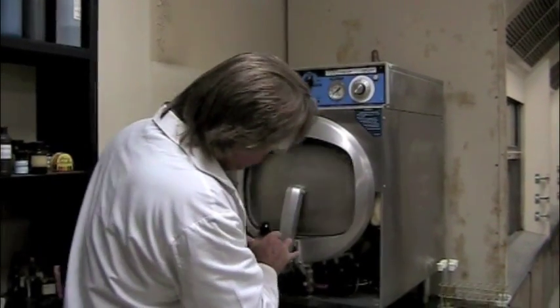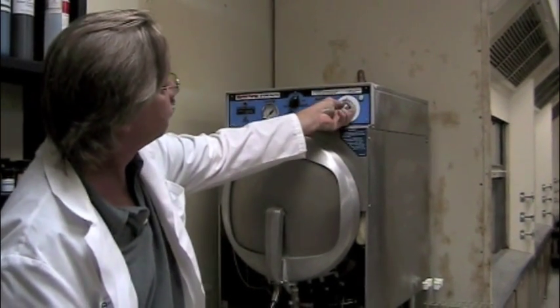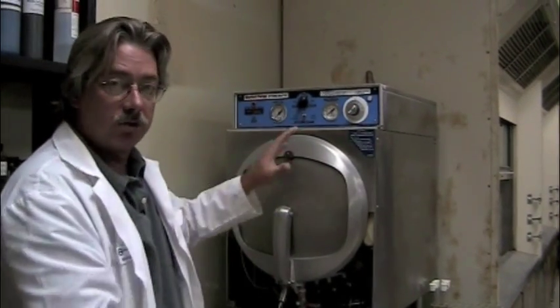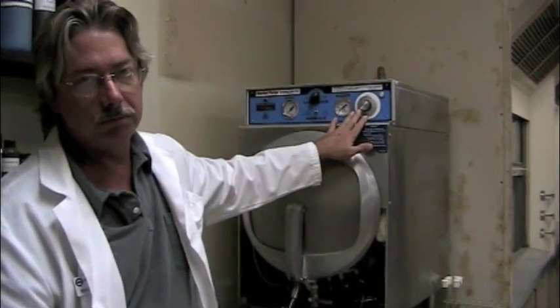What I'll do is close up the front door and set the timer for 15 minutes. The timer won't start right now — it will wait until the temperature and pressure are up. Once it reaches the set pressure and temperature, then your 15 minutes will begin.